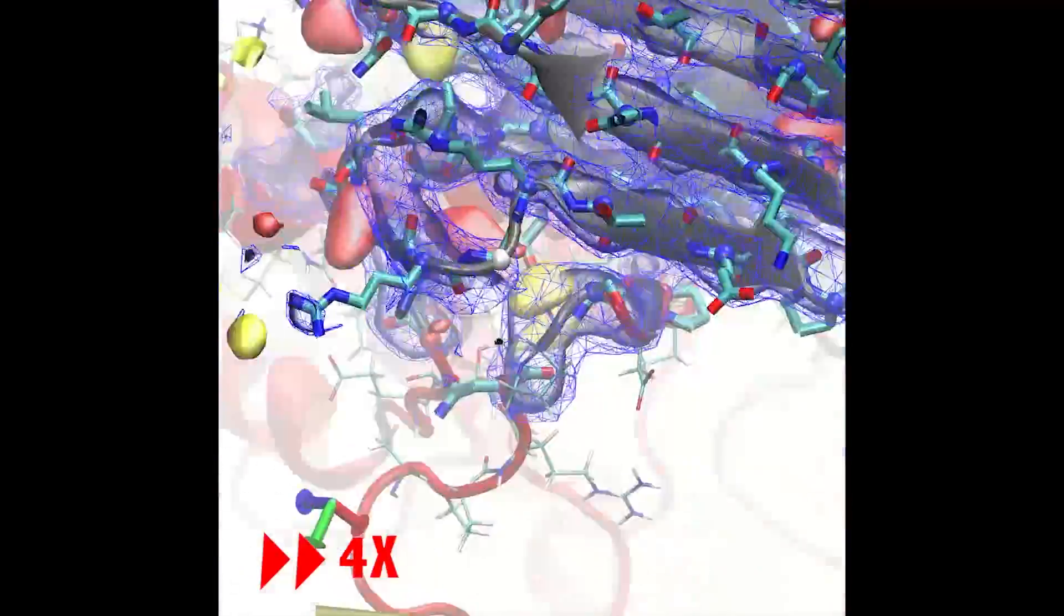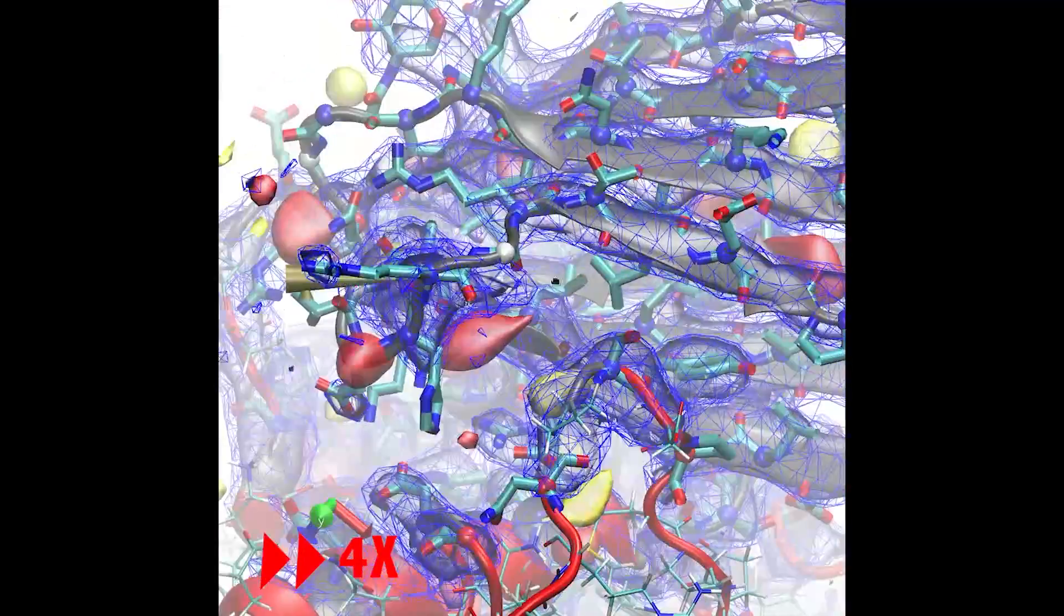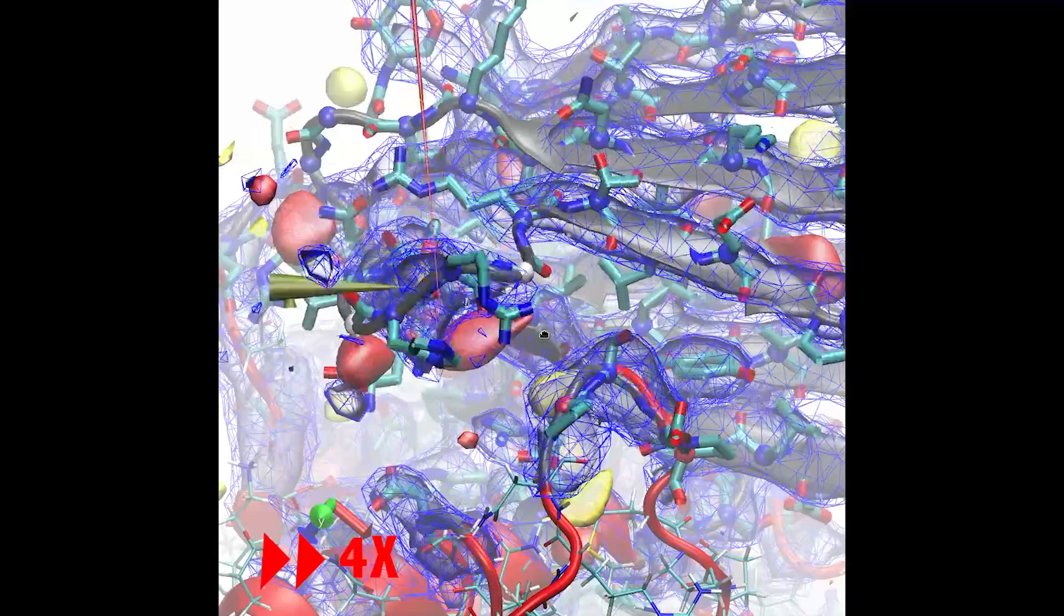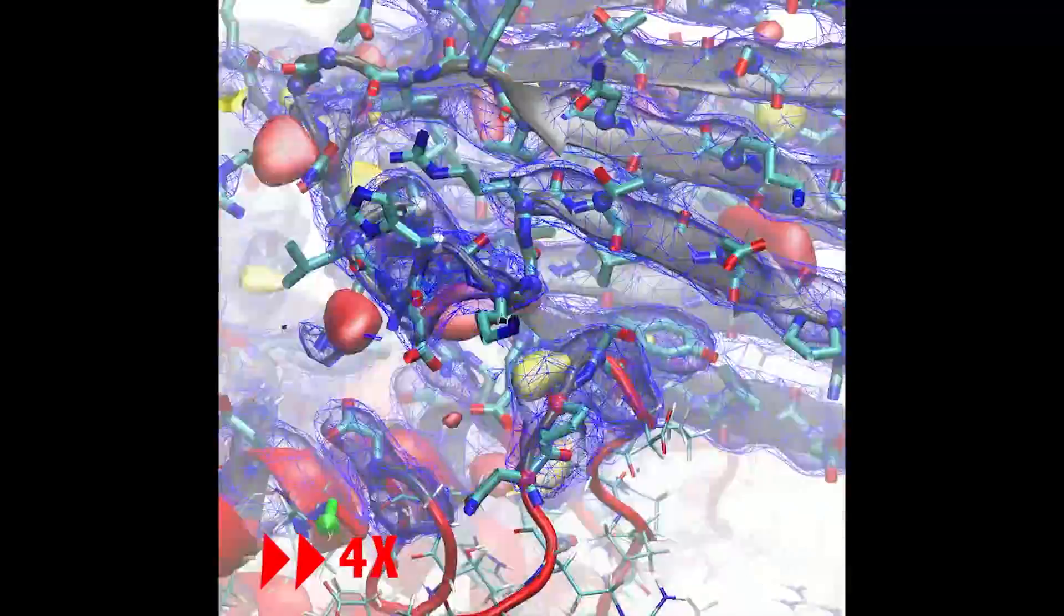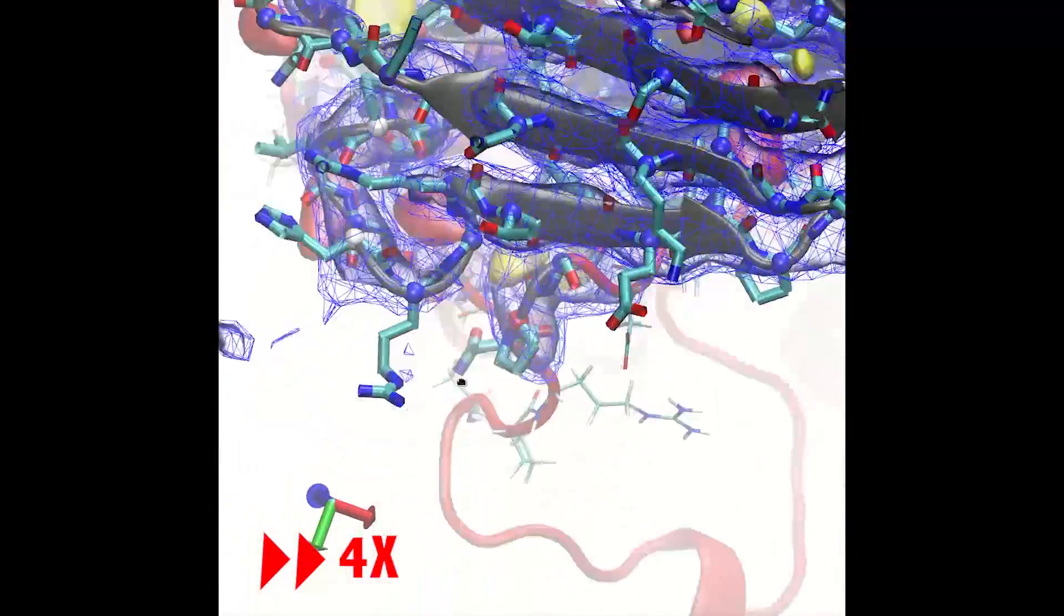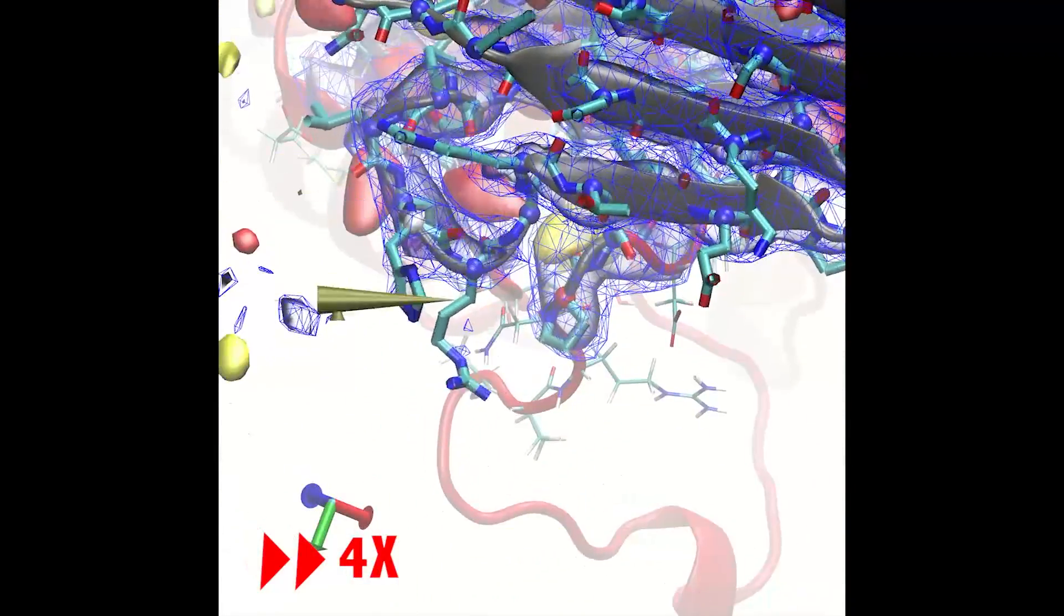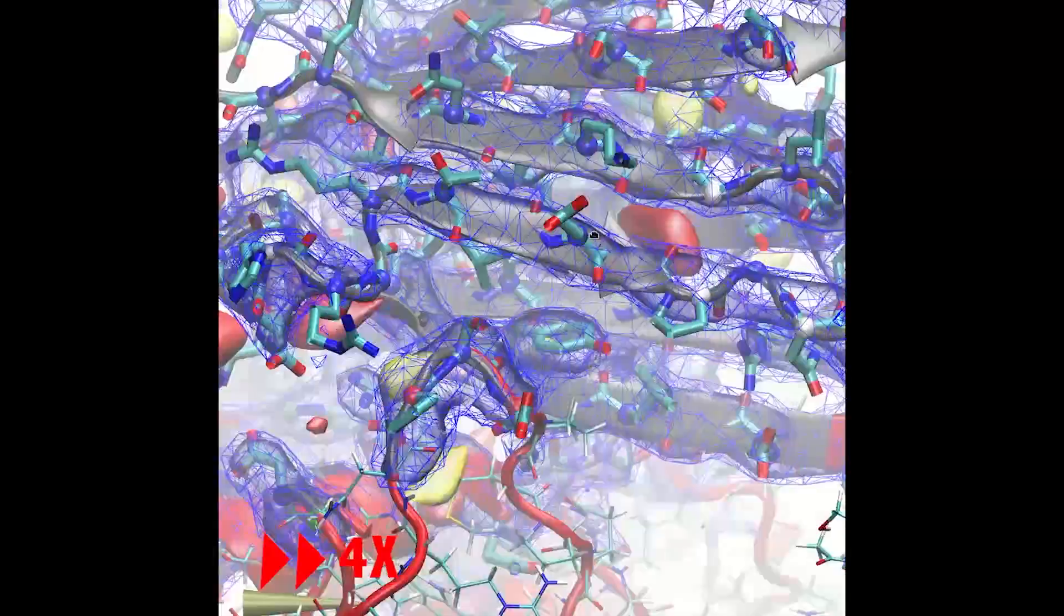In total, the simulation contained 6,335 atoms, including all the hydrogens. To work through this entire 1638 residue structure from end-to-end using overlapping IMDFF simulations, takes approximately half a day on this machine.